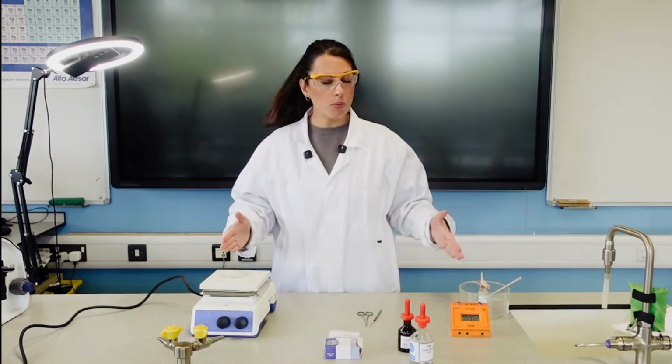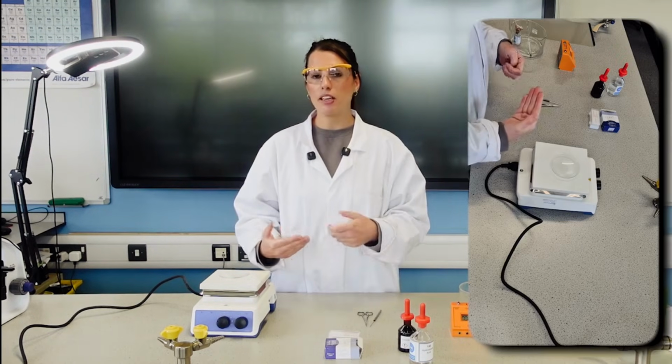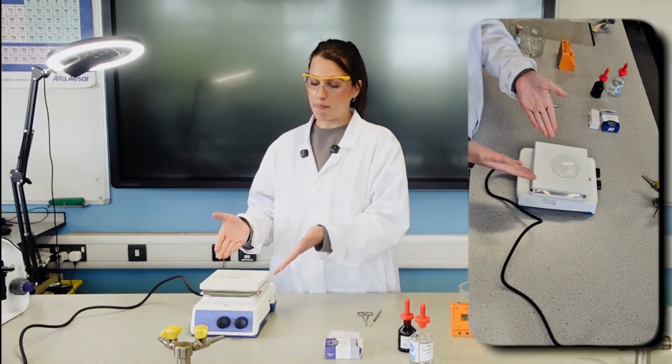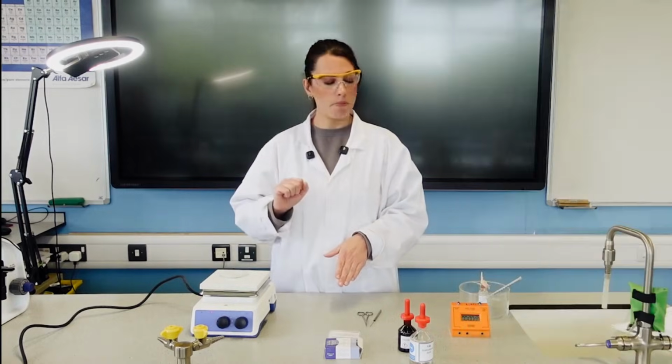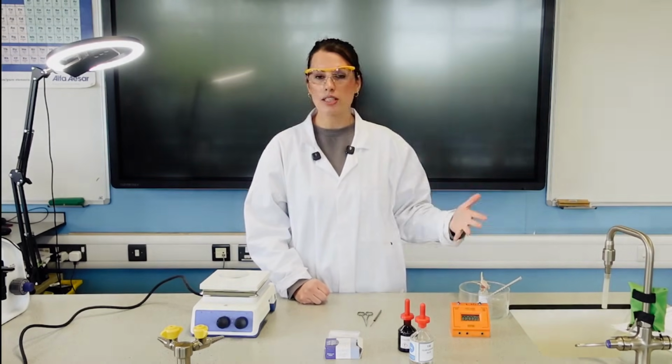And then lastly, depending on what you're using as your heat source to heat up the acid, students need to be careful that they're not going to be burning themselves. If you're using a heating mantle, point out that they shouldn't touch the top. If it's hot water, make sure that they are handling the kettle, if that's what you're using, with care as well.